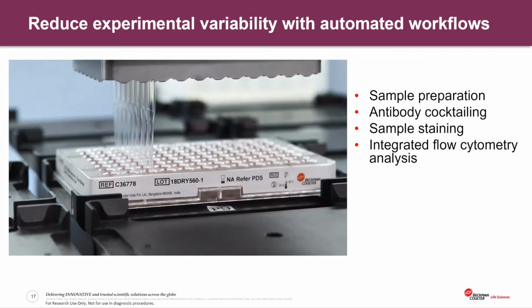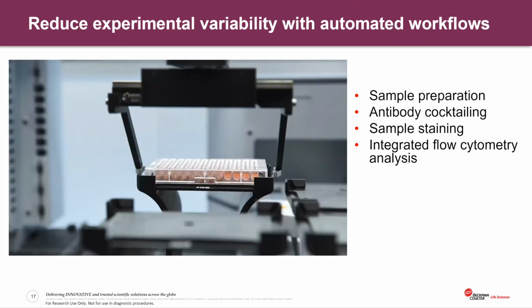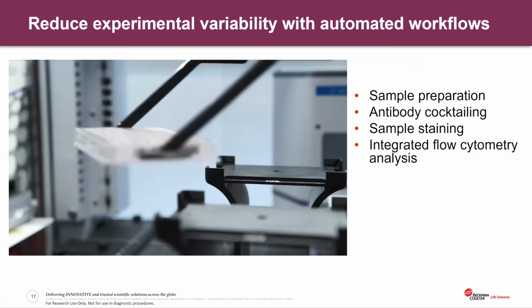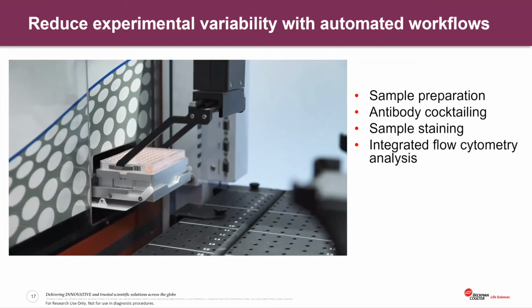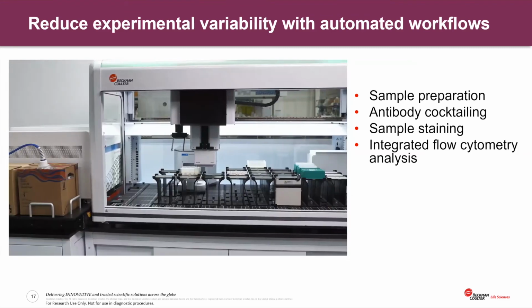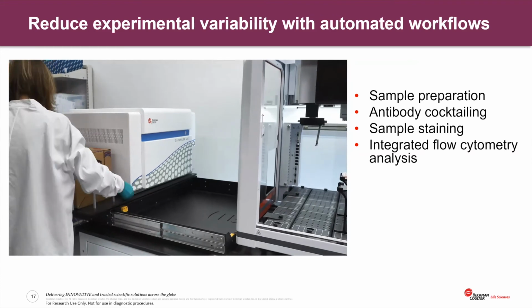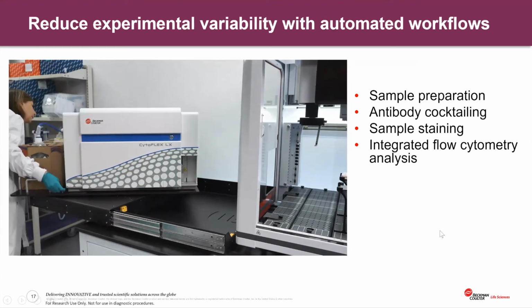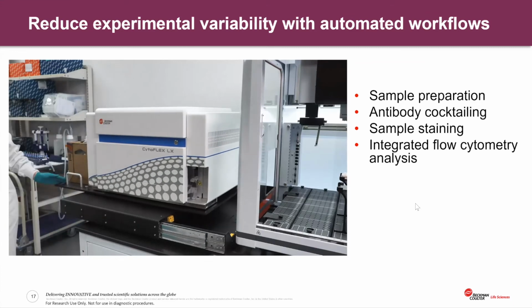It's delivering the prepped samples that have been washed within a centrifuge to the flow cytometer and analyzes the data. This analysis can then be integrated with specific utilization of API to basically allow you to push the data out to a cloud for additional analysis.